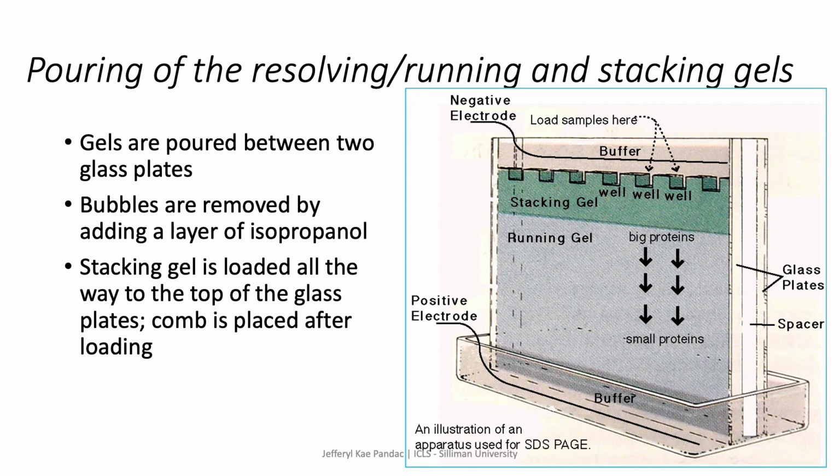When the resolving gel is solidified, the stacking gel is loaded all the way to the top of the glass plates. The comb is then placed just after loading. The gel is then allowed to polymerize, or solidify.